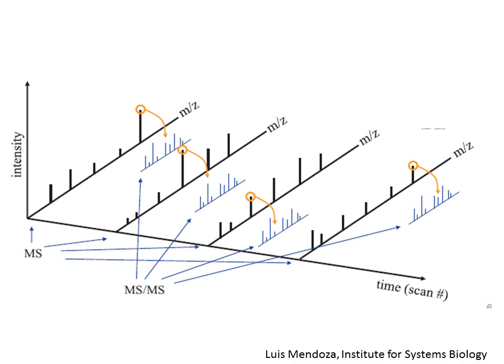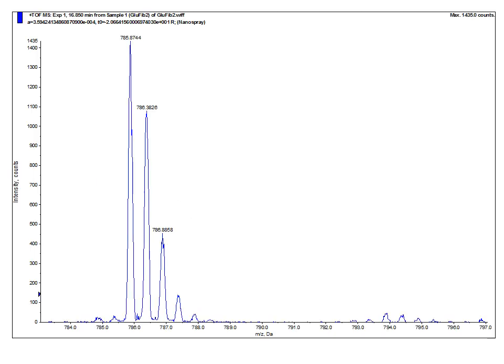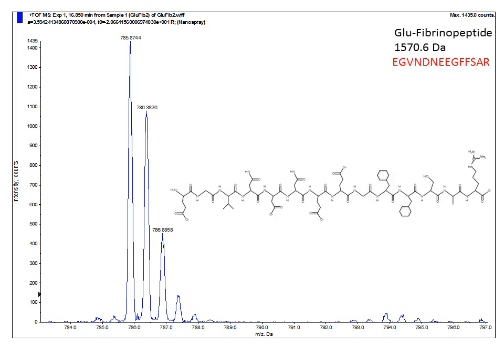So the mass spectrometer is continuously executing a sequence of scanning for intact peptide ions, selecting one of those ions, fragmenting it, and measuring the mass of the fragment, and then repeating that. In the scan for intact peptide ions, a mass range of 350 to 1500 Daltons is typically scanned, but this spectra for glu-fib has been zoomed in.